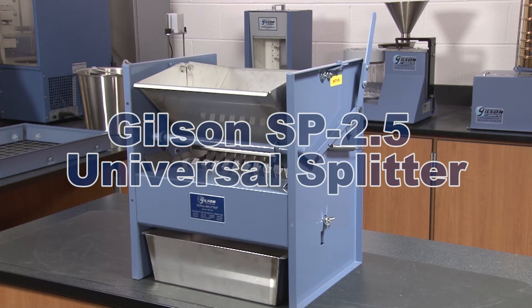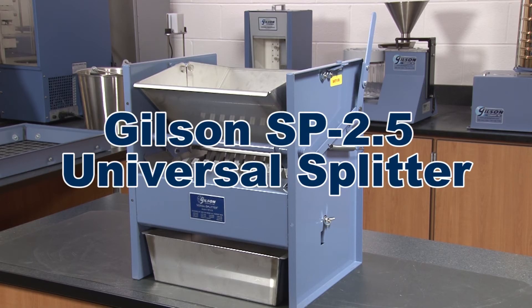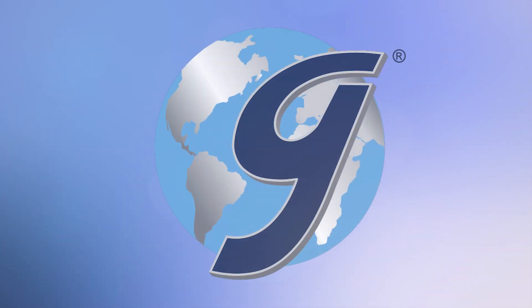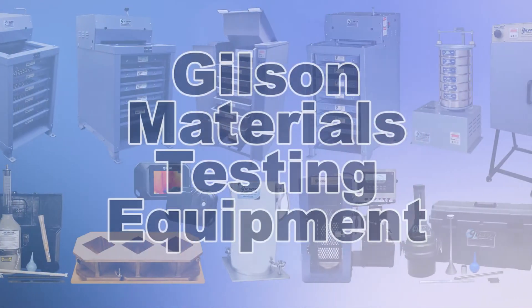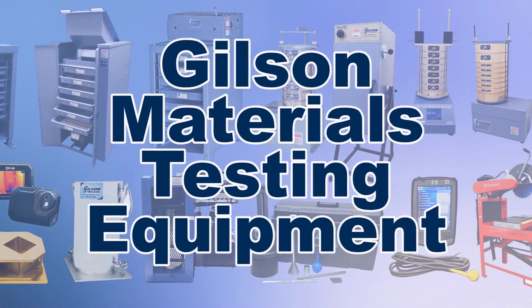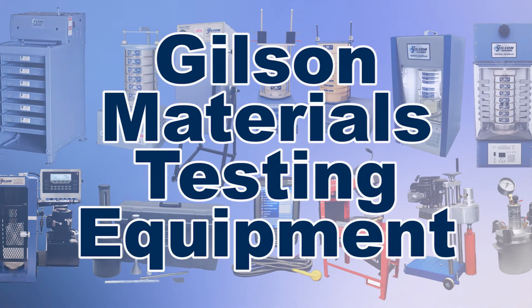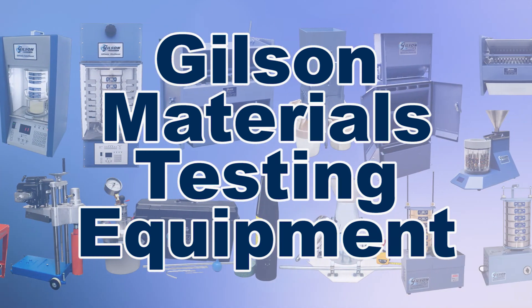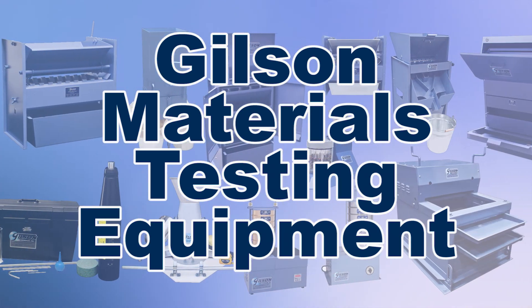To make the Gilson SP-2.5 Universal Sample Splitter the right choice for your materials testing lab. With Gilson's complete family of materials testing equipment, offering a wide range of performance features and capacities, Gilson has the right equipment for your accurate representative sampling needs.